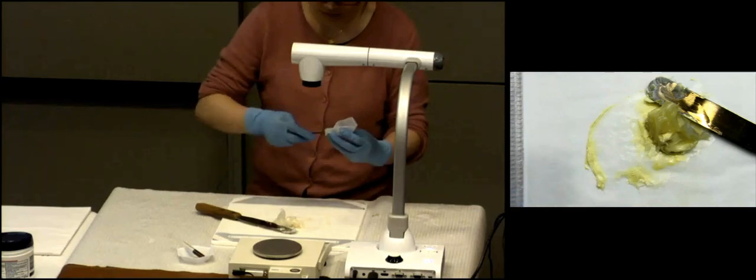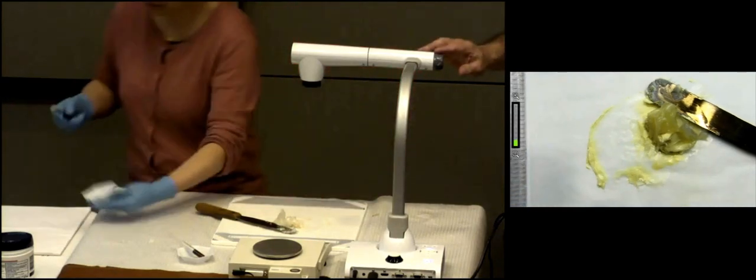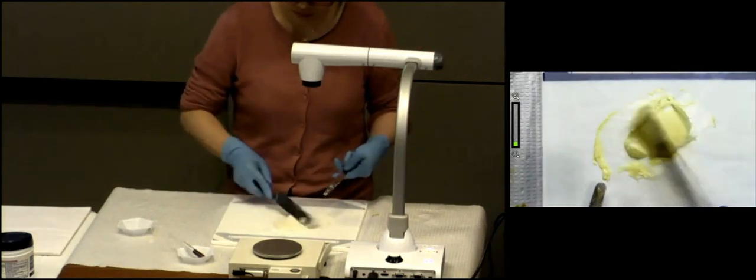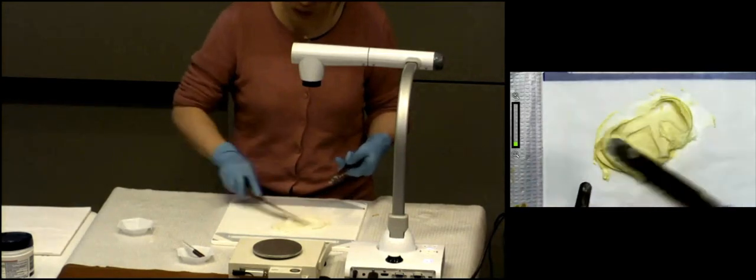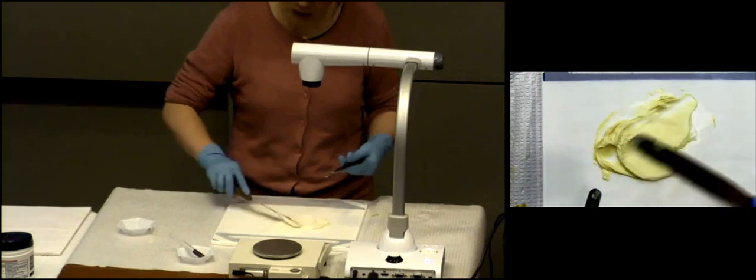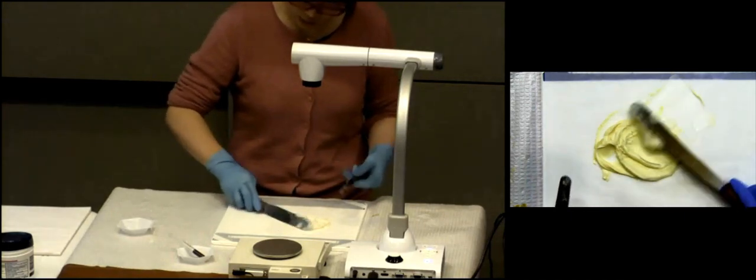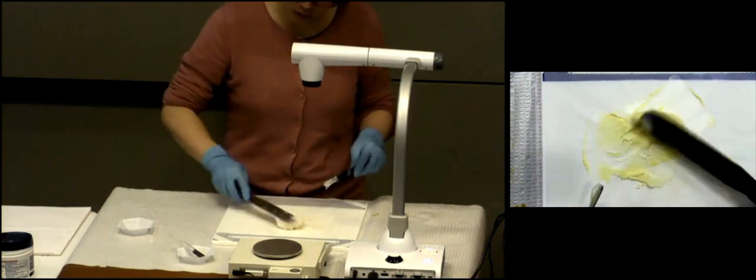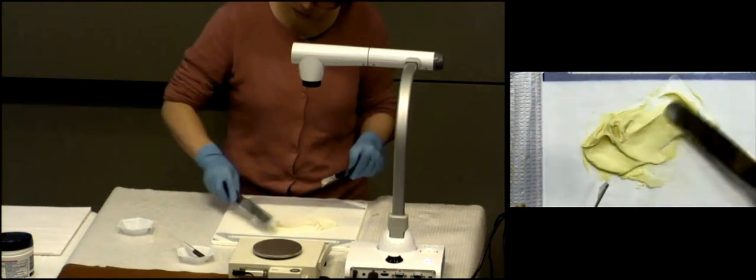And when she's finishing it up, you can kind of watch her do that. I want to point to steps. Well, never mind. Hold on. We're done. Okay, so this is called spatulation. All right, I'm trying to mix well. I want to make sure my mixing here is uniform between hydrocortisone, LCD, and the base.